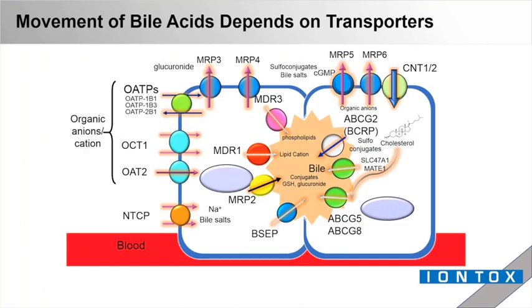And so again, we're using these primary hepatocytes from Qualyst BioIVT. They're transporter certified, so they have the full complement of transporters here. And in sandwich culture, they form tight junctions and also these bile pockets. And so the localization and function of the uptake and efflux transporters is really crucial for fully understanding cholestasis, as well as extrapolating from in vitro to in vivo.